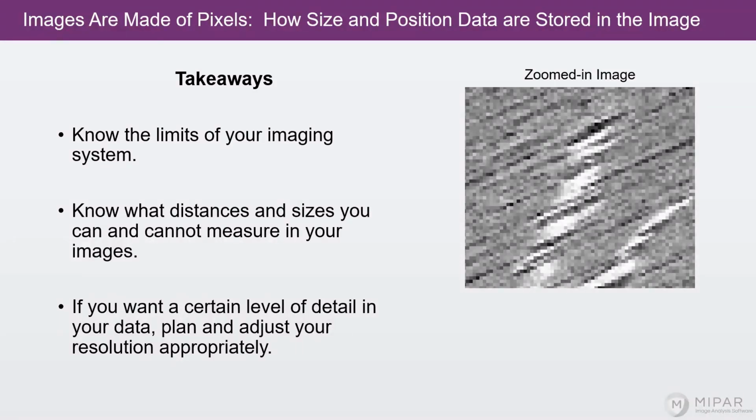One thing to note is that noise in your image can make your effective resolution not reach the theoretical maximum resolution. For instance, take these two supposed features here. Are they really two features? Or are they one feature that was cut by a bit of bright noise? Now it's one pixel across.